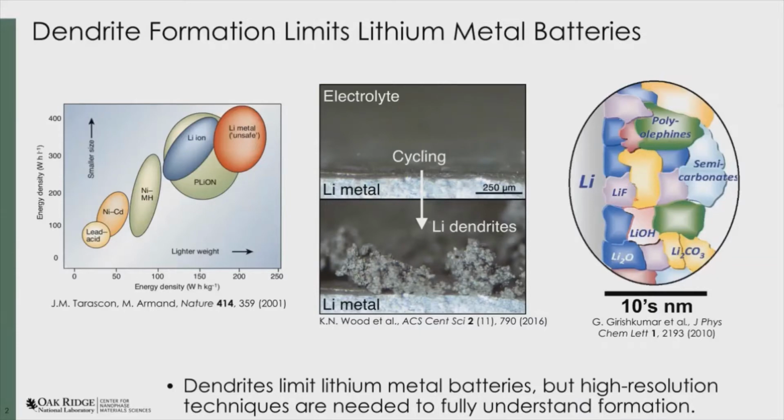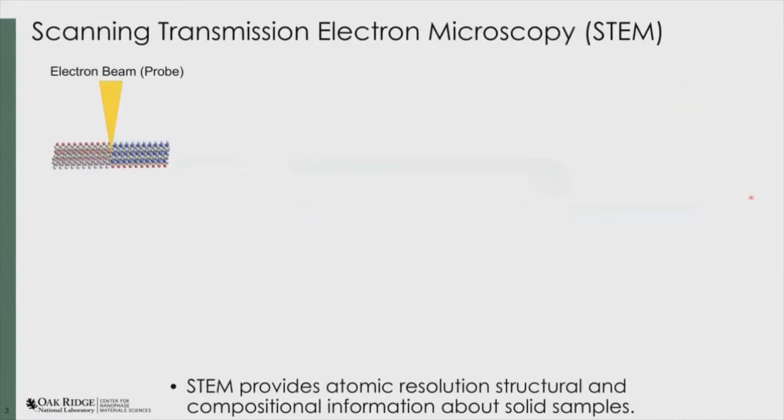from growing. But the problem is, this is nanoscale and it's at a solid-liquid interface, which presents a lot of problems. And so we need a really high resolution technique that can look at this with the whole interface intact. So I'll tell you about a couple of techniques that we use that are very high resolution, and then how we can adapt those to use with cryogenic techniques.